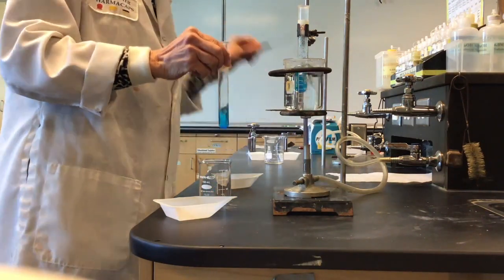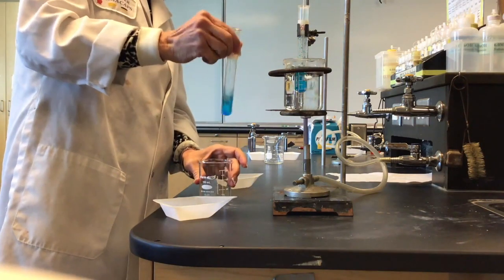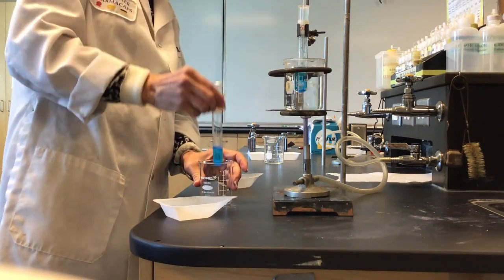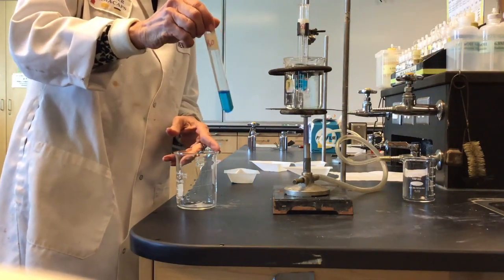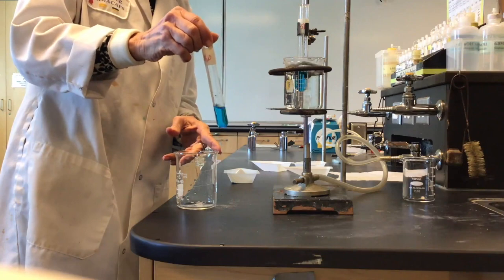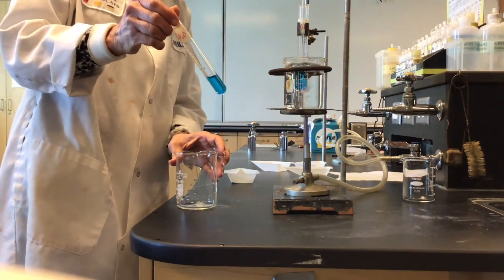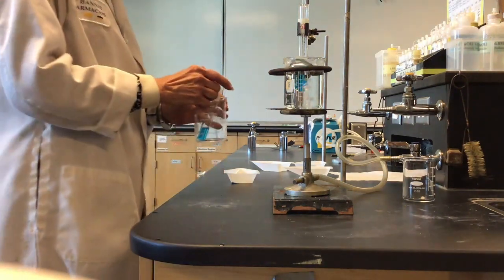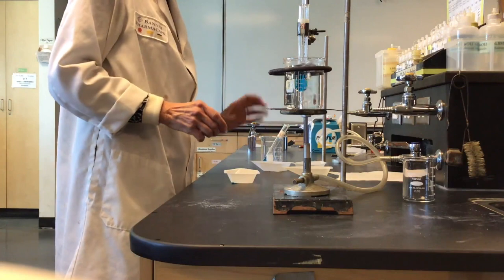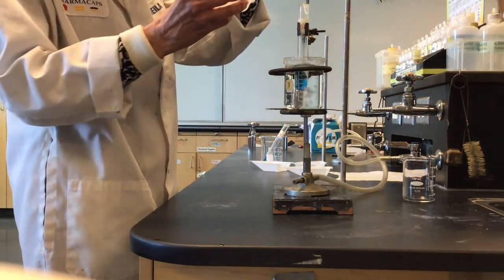Mix these up again and see if they dissolve. So even with a lot of swirling, I could not quite dissolve all of that solid copper sulfate pentahydrate in the water after increment number 3. So about 1.5 grams is what we were able to dissolve in the water approximately at room temperature. The one in the boiling water, however, is completely dissolved.